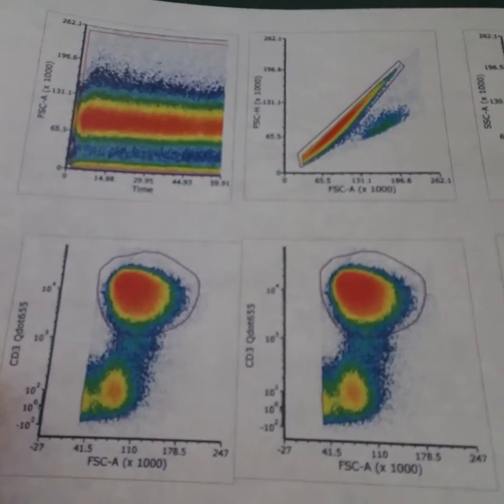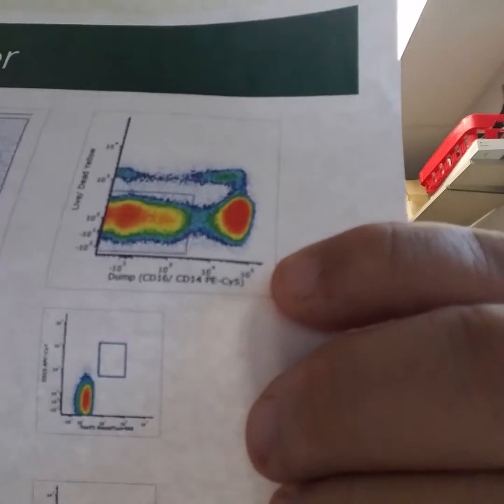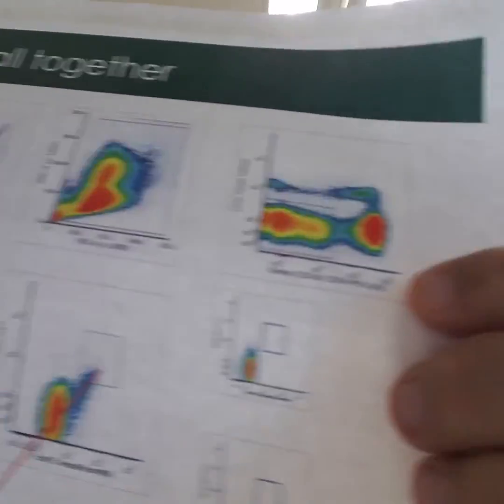Now I go into my detailed analysis using my antibodies. I'll start with my primary antibodies — in this example, I'm using CD3, and I plot CD3 versus scatter to identify my CD3 cells. From there, I go to CD4 versus CD8. And from there, I move into my rare event population, shown here, along with my FMO controls. So that's the way I develop strategies: starting by eliminating instrument-caused artifacts, then using my antibodies to do the heavy lifting.